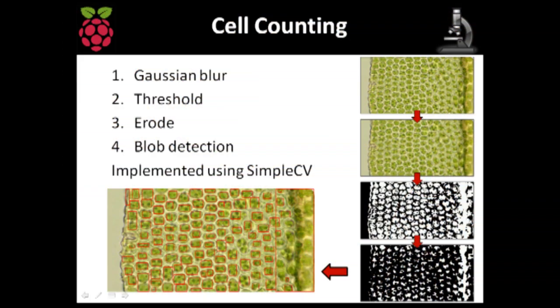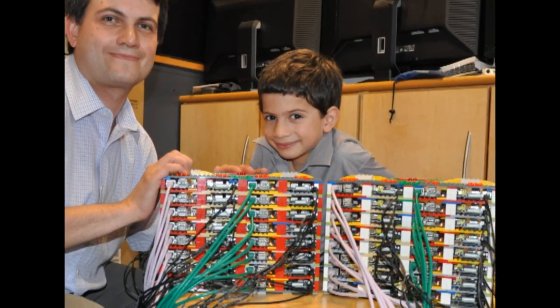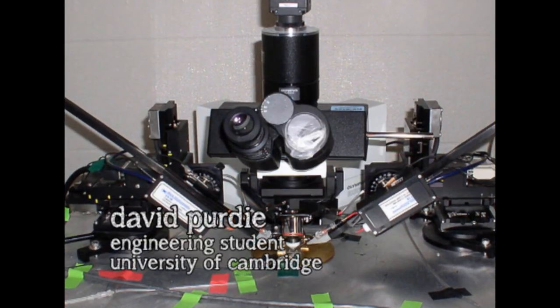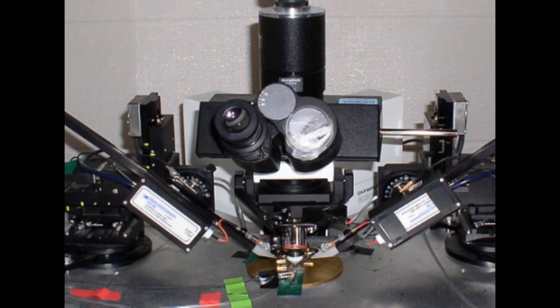The goal is to find the best way to build a high-quality research tool at a reduced cost, in the belief that science should be for everyone. So when we first started the project, we looked around at the typical microscopes that were being used in research labs.